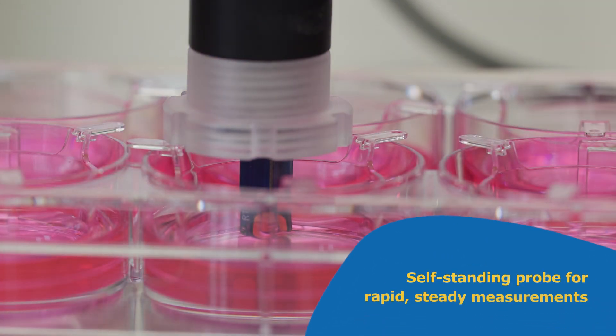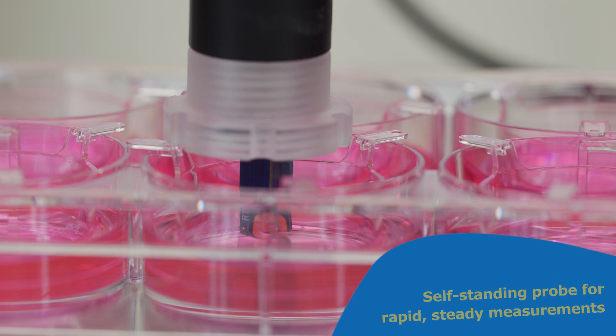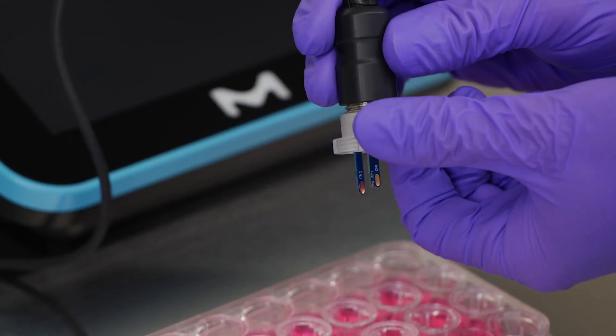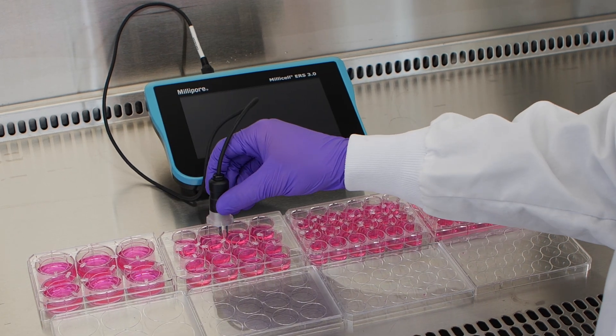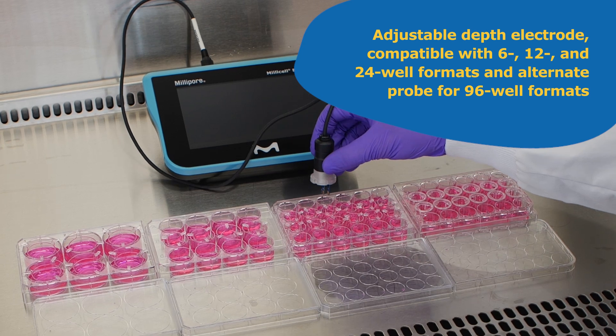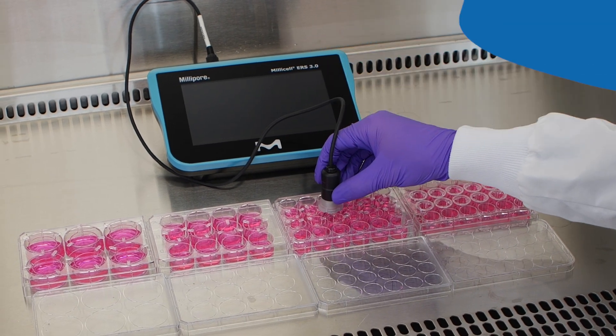The standing in-well probe enables more stable, consistent readings with improved ergonomics. Adjustable probes can adapt to various cell culture insert depths, compatible with 6-well, 12-well, and 24-well formats, with an alternate probe for 96-well formats.